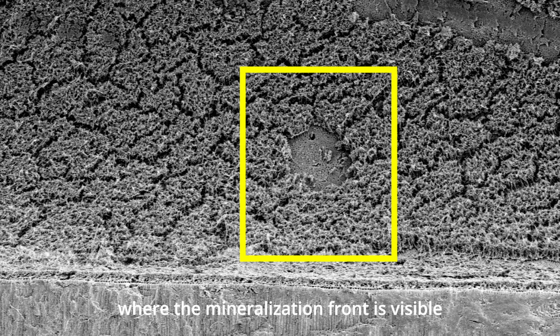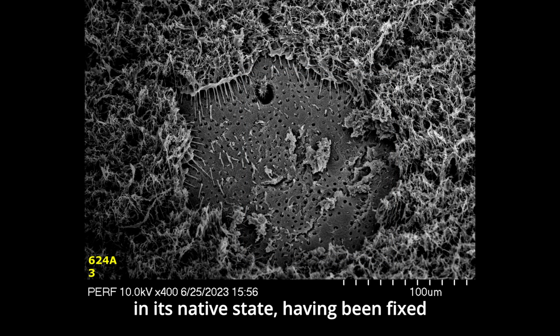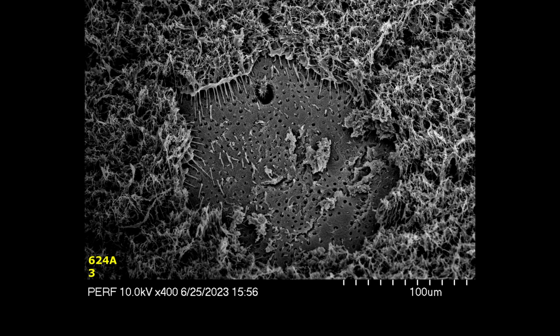And there you can see a little area where the mineralization front is visible under the predentin. And you actually get a pretty good view of the predentin in its native state, having been fixed and then dehydrated. You can actually see the Tomes fibers going from the predentin into the mineralized tubule.